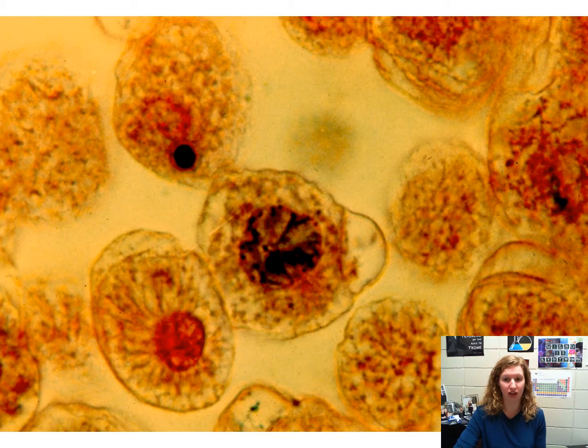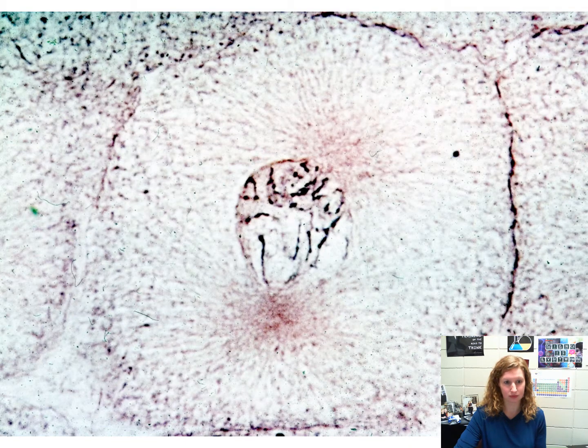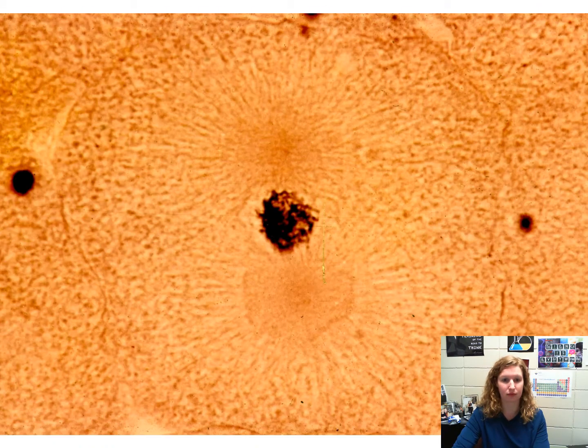Early prophase. Middle prophase. Late prophase.